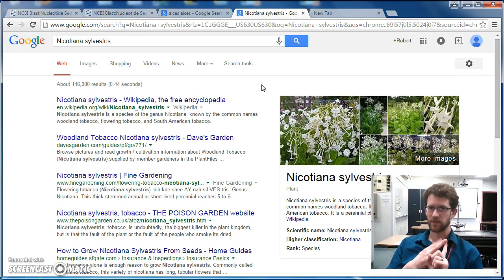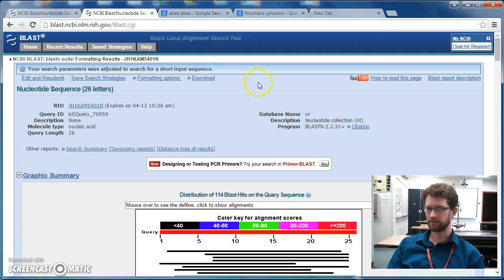The 18 base pairs can randomly show up throughout the tree of life due to random mutations in evolution. So it probably is a completely random effect. But it does mean that about 18 is our threshold for when we can start getting viable results on our gene sequence searches.